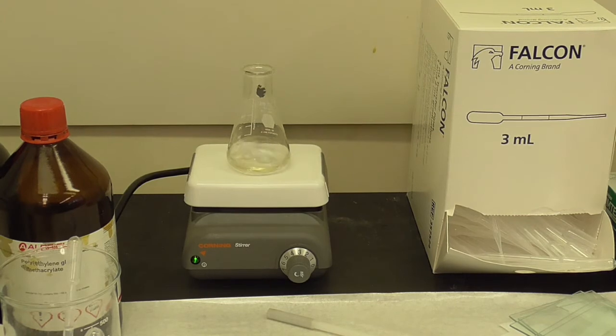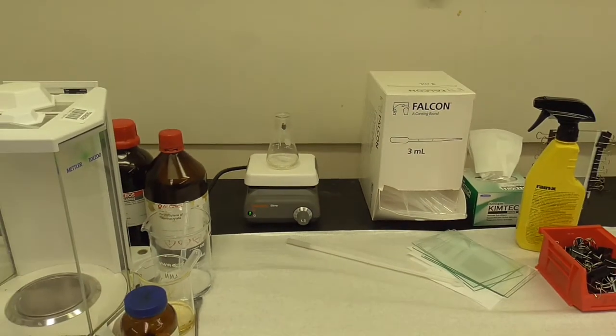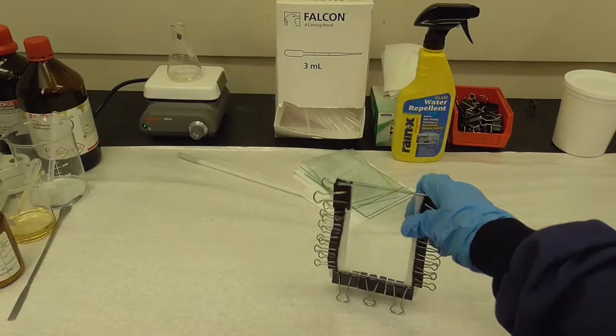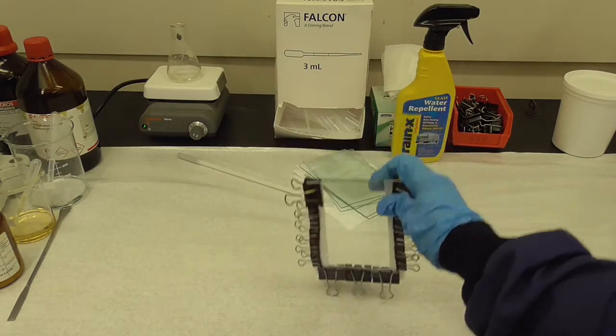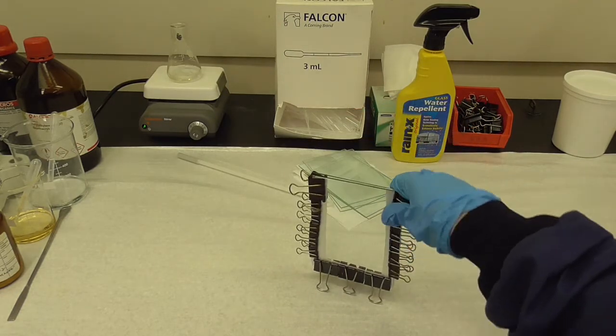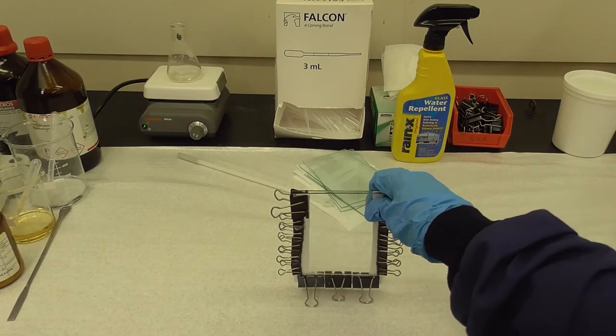Now while that is mixing we'll make our mold for the polymer. Here is an example of the mold. We're going to make two sheets of glass with the Teflon separator and then clip together with these binder clips.